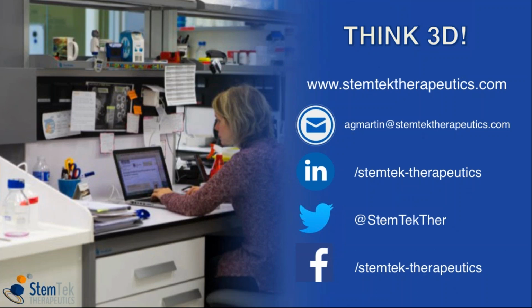Okay. I think I have another question which came in: after you finished an experiment, people might be able to get access to the spheres for dissociation. I think this might be possible using enzymes to get single cell suspensions which can be analyzed in a FACS system. Absolutely.